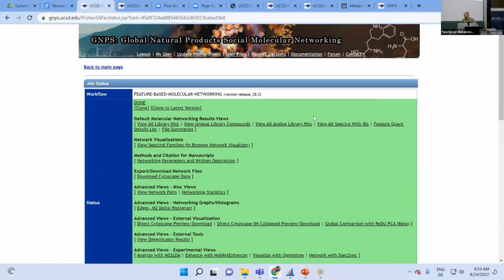We typically lower it to maybe 4 for very small ones, but then you should also be careful. You can also lower the cosine similarity, because you could get true matches with 0.6 or something, but you also get way more false positives. It's very hard, and you can have false positives with 0.99. So it's really best to look at the matching spectra. Obviously, the more hits you have, it's not feasible anymore.